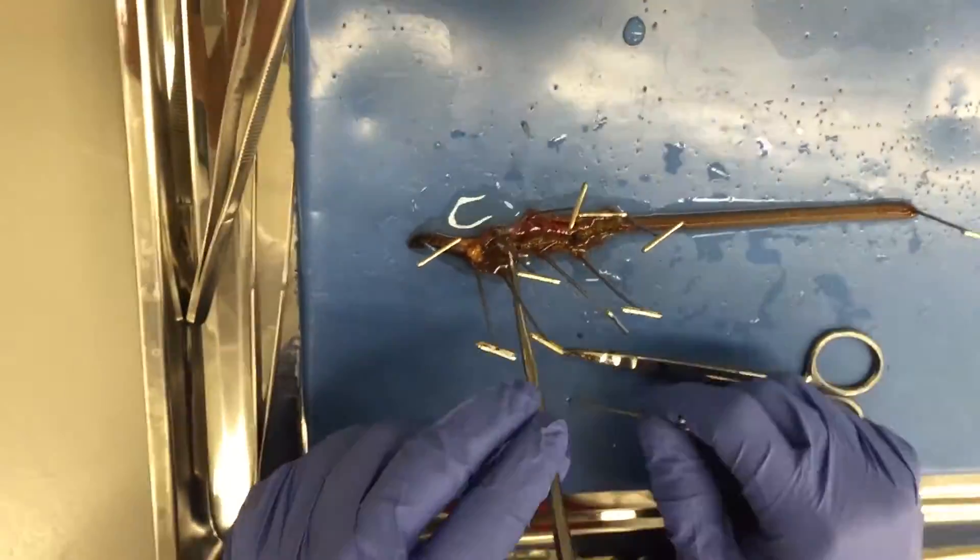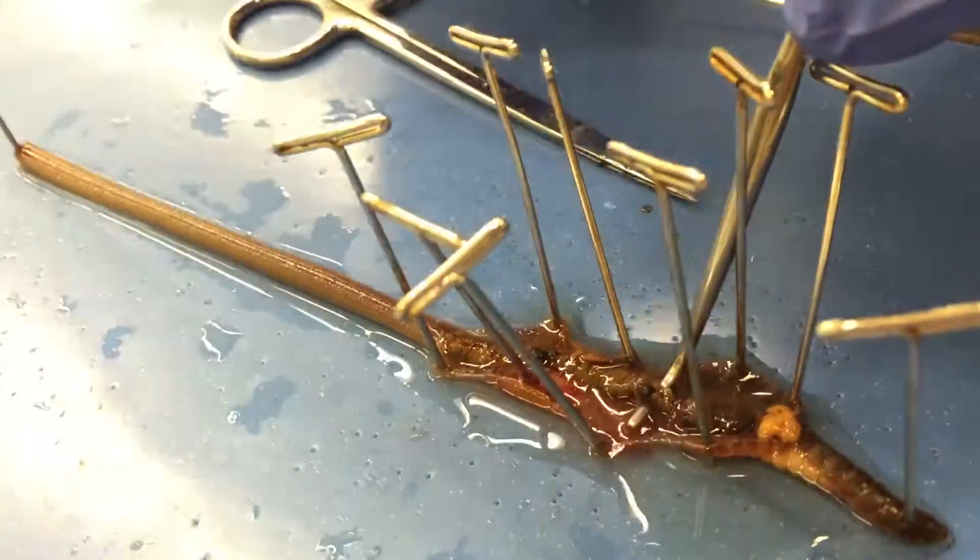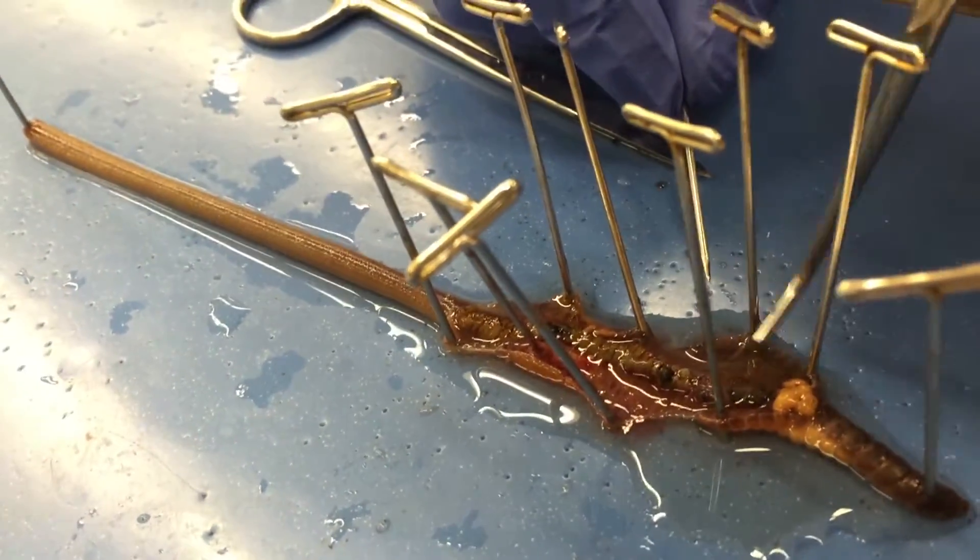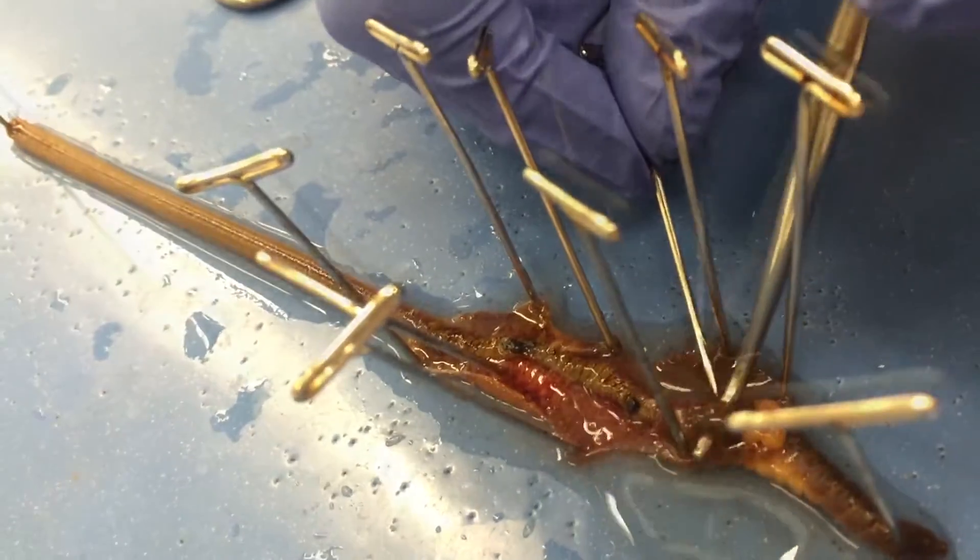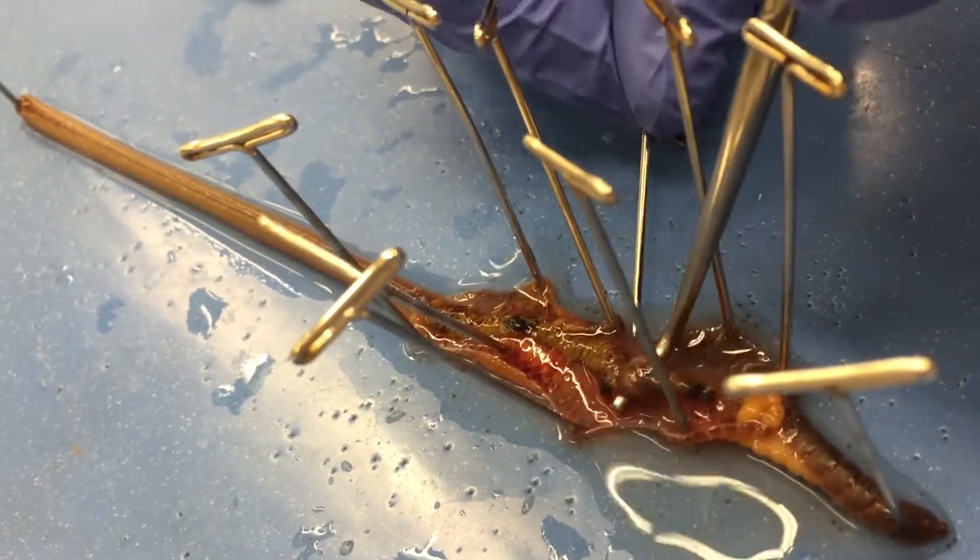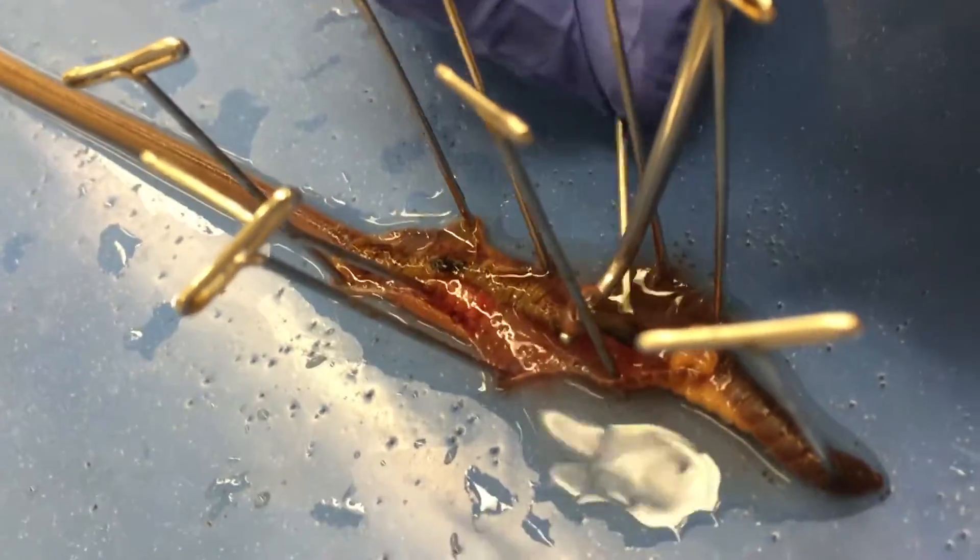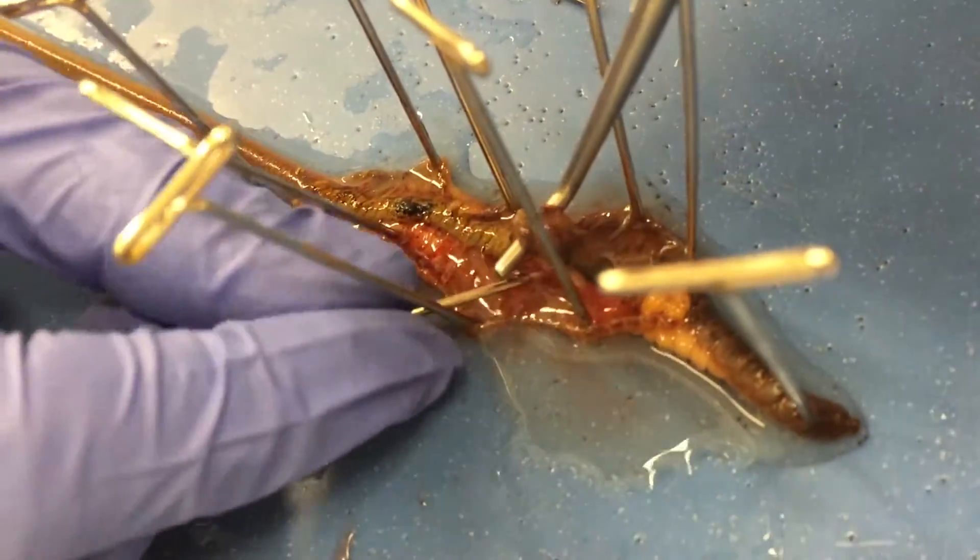Using the probe and a sharp pin, cut away the septa and connective tissues that are holding the crop and gizzard in place. Remember, be careful not to puncture the crop or the gizzard and to only cut away connective tissues on the outside structure.